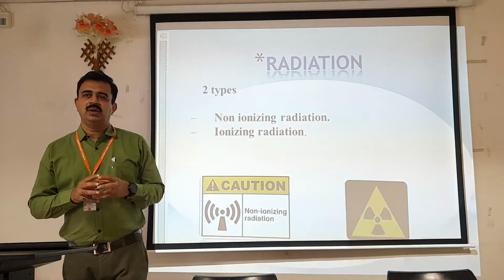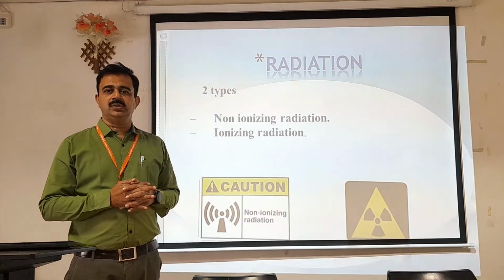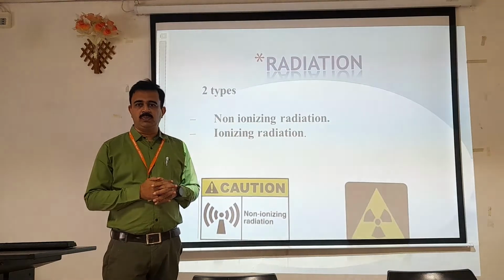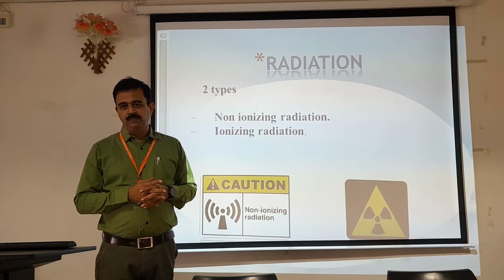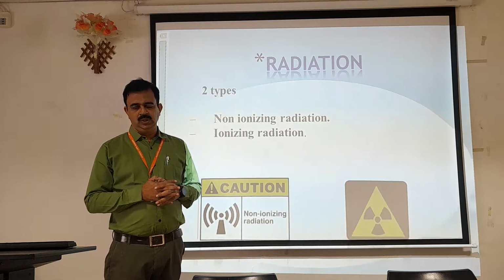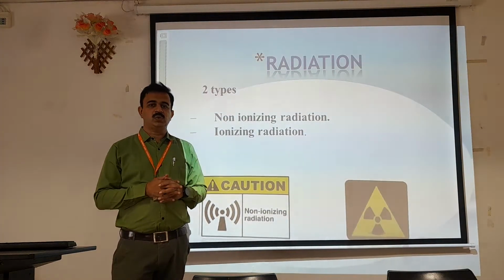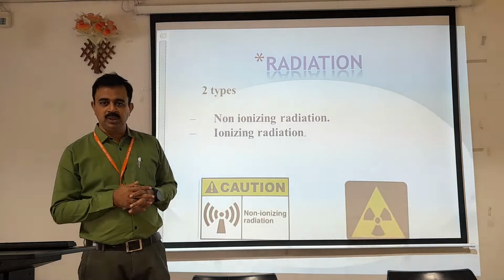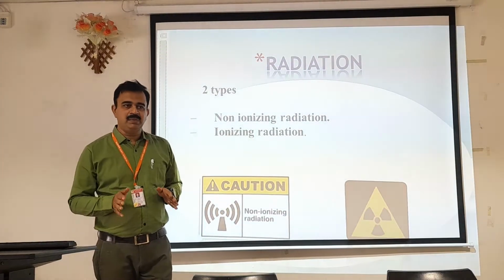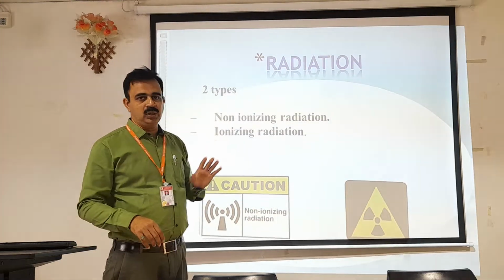Now the question arises: why does sterilization by radiation have to be done? Because there are certain materials or chemicals or elements present inside the culture media which are very sensitive to heat, neither dry heat nor moist heat. So for that purpose, one has to carry out a sterilization method by which complete removal of organisms can be done. This can be done specifically with those substances which are called radiation.